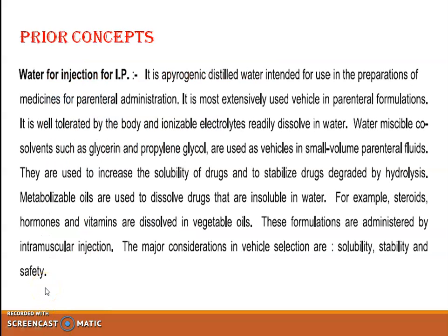First, the prior concepts we are going to study. First we will study what is water for injection. It is an apyrogenic distilled water intended for use in the preparation of medicine for parenteral administration. It is the most extensively used vehicle in parenteral formulation. It is well tolerated by the body, and ionizable electrolytes readily dissolve in water.